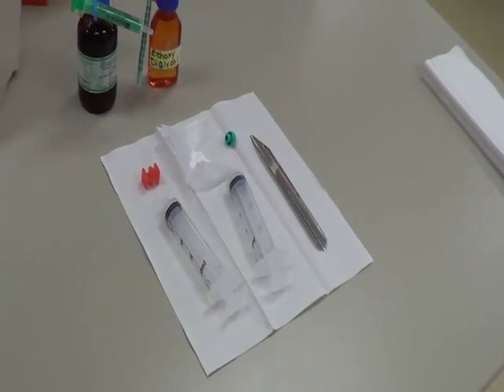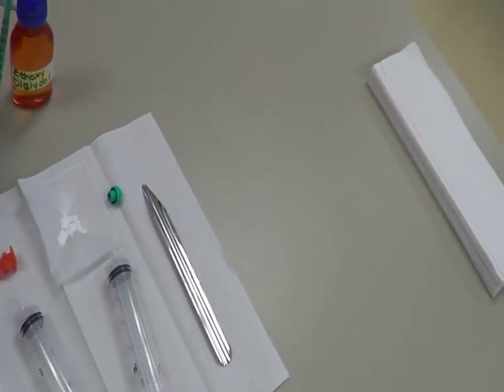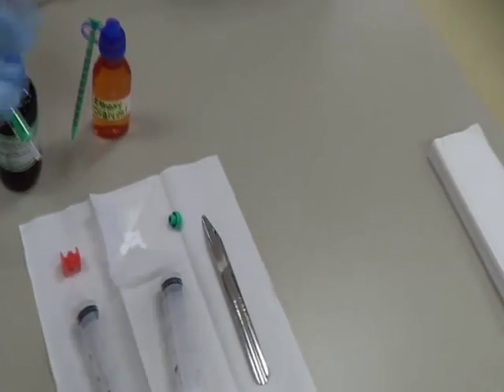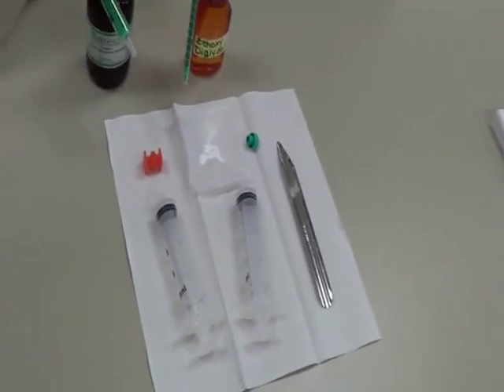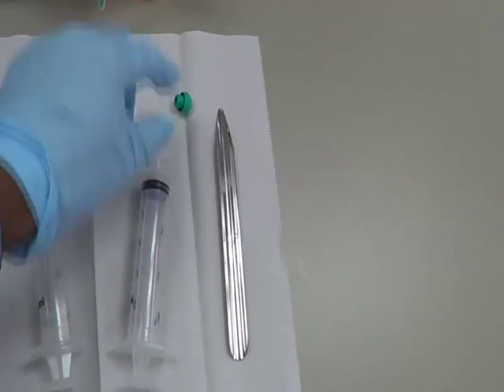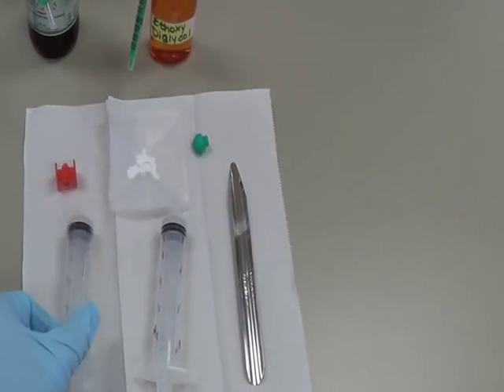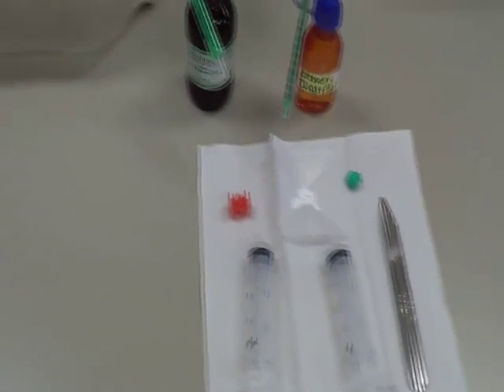For this we have Lecithin Isopropyl Palmitate, that is in short it is called LIPS, and Ethoxidiglycol. We have a mock drug, and we have Luer Locks and Luer Tips over here. And we have two 20ml syringes. So this is what we need.